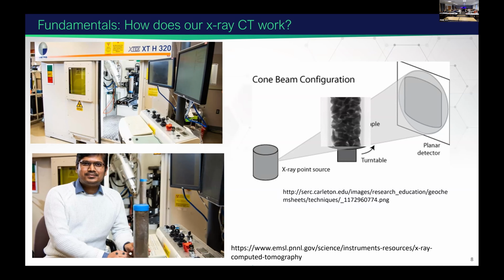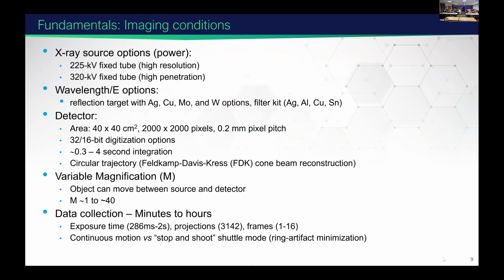This is a picture of the EMSL system. And this is my colleague Anil proudly posing with a MONet core. The MONet cores are scanned as received. They are 3-inch diameter, 1 foot long or tall. And you can see that also in the scanner. I'm going to go through these parameters of our system because they will describe the different options and considerations that you have in imaging.